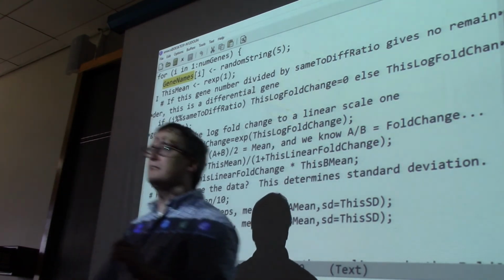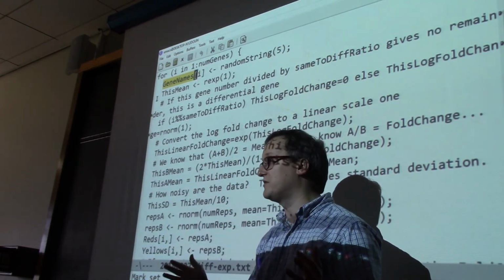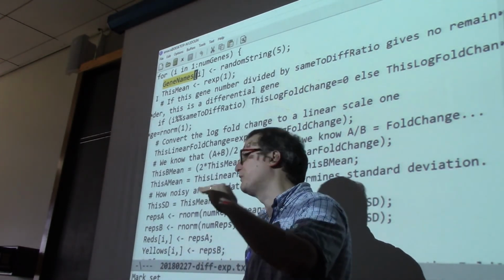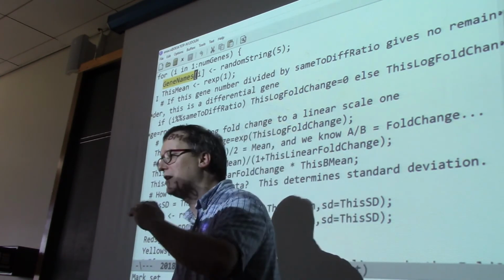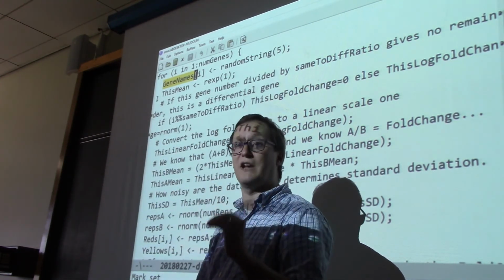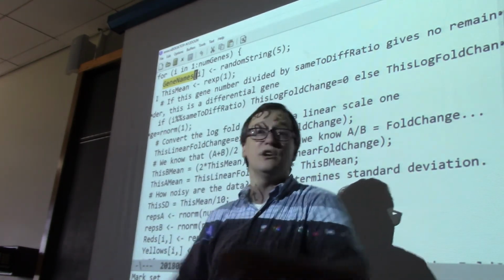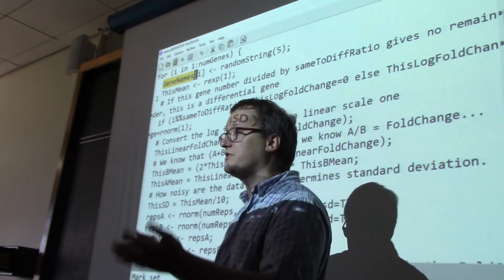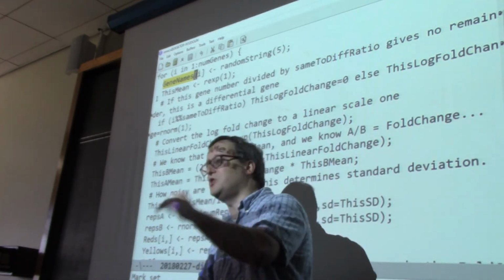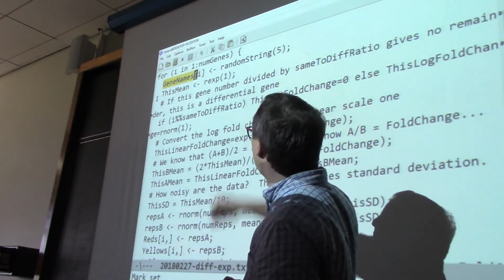So I'm not telling it how to set the values of all elements inside the gene names vector. I only care about this ith value. You'll frequently see computer science terms like that. So in this case, I've told it I want random strings of characters up to just 5 letters long. I could have set it to 8, I could have set it to 4, and so on. What I found is that if I set it too low, I ended up getting the same gene names on different rows. I didn't want that. So I set it to 5. That worked okay.